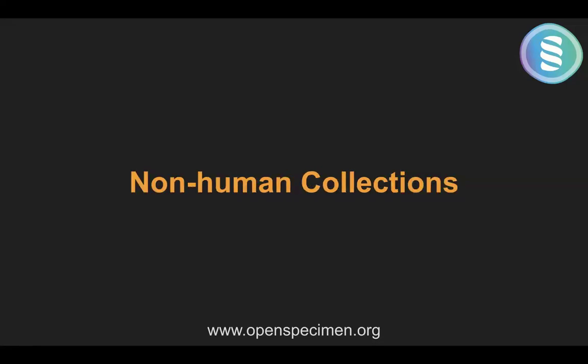So this is what we call highly configurable. That is, within an application, there could be different groups or different studies, each doing their own thing, or a combination of these kinds of things. Somebody running longitudinal studies, somebody running more disease-based biobanks, somebody running non-human collections, all within one instance. And all these configurations can be done by yourself, obviously with some amount of training, but it's fairly easily doable through the user interface.